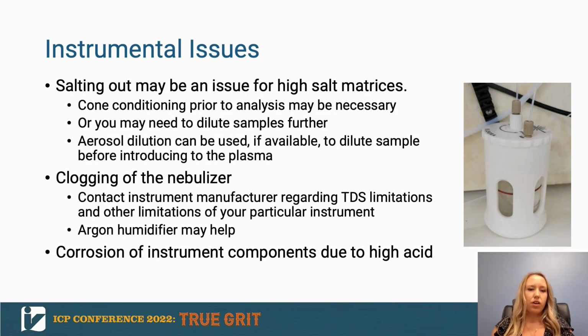Another problem you could run into is clogging of the nebulizer. We recommend contacting your instrument manufacturer to get recommendations on appropriate introduction system setup for your particular analysis prior to running the analysis. This would include any total dissolved solids limitations for the instrument or the intro system components. And then high acid matrices may also cause increased corrosion on metal components of your instrument. So this is going to be a particular concern for hydrochloric acid. So we recommend reducing the hydrochloric acid if possible to prolong the life of your ICP as well as reduce the maintenance required.